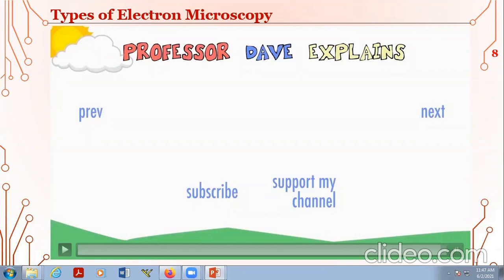दोनों एक्सपेंसिव हैं और दोनों के अंदर ये ड्रॉबैक है कि लाइव स्पेसिमेन को डील नहीं कर सकते, बिकॉज हमें स्पेसिमेन को कट करके उसको पूरा हाइड्रेट करके डिहाइड्रेट करके फिर यूज करना पड़ता है। Great, great, awesome. Anaya?